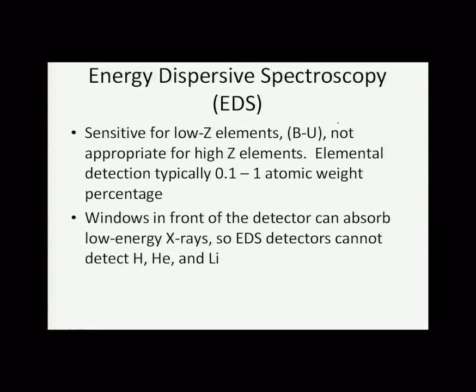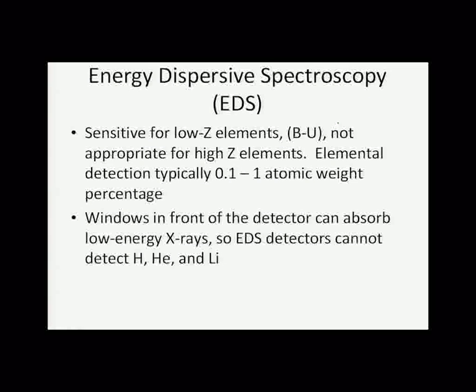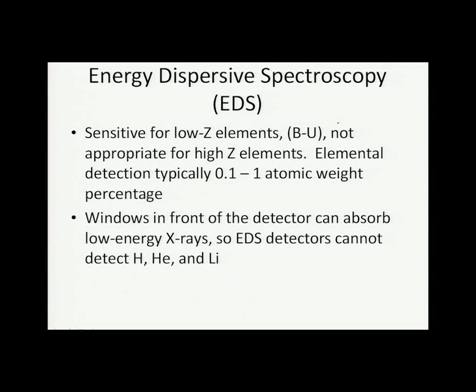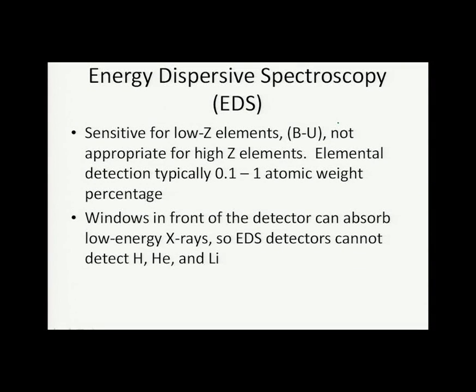And also, it's not as sensitive for higher atomic number elements. But there is a wide range over which it is a very useful characterization tool for compositional contrast.